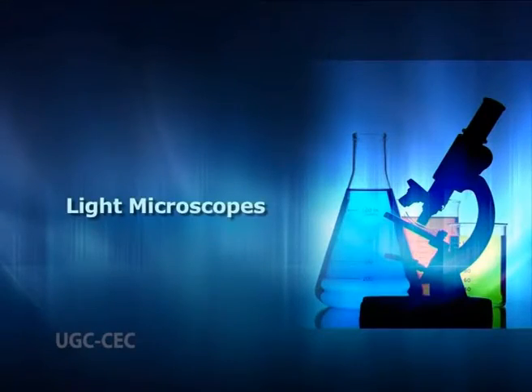Light microscopes. Now, let us understand the meaning of light microscope. It is a type of microscope which uses light as a source of illumination. Several types of light microscopy are used today in laboratories, working on different patterns of illumination which are based on the types of specimens.